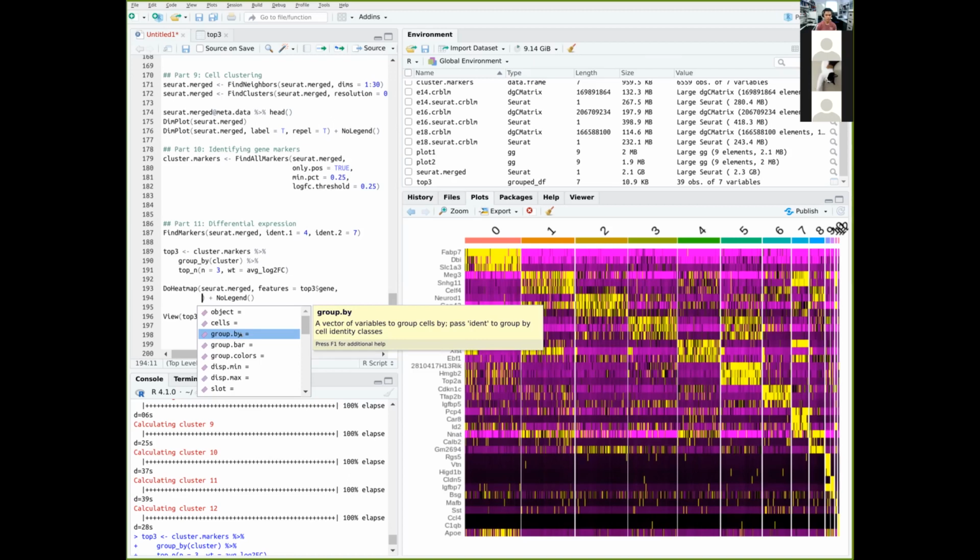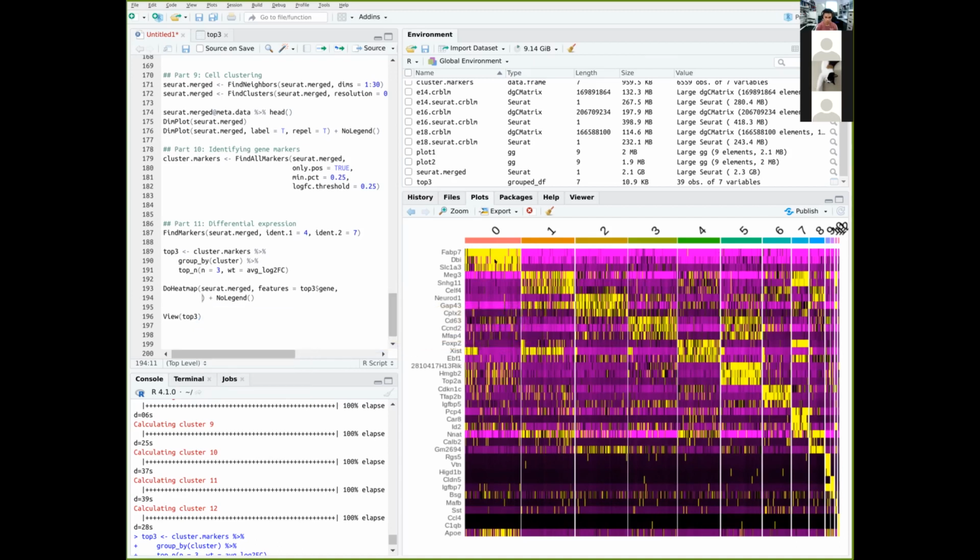It will not look as nice, because the genes that we plot out are markers for each cluster. So basically what I want to say here is that this looks very representative of marker genes, because let's say the first 2 genes are highly expressed in cluster 0, but not in other clusters. And this is like a diagonal line that labels highly expressing genes.